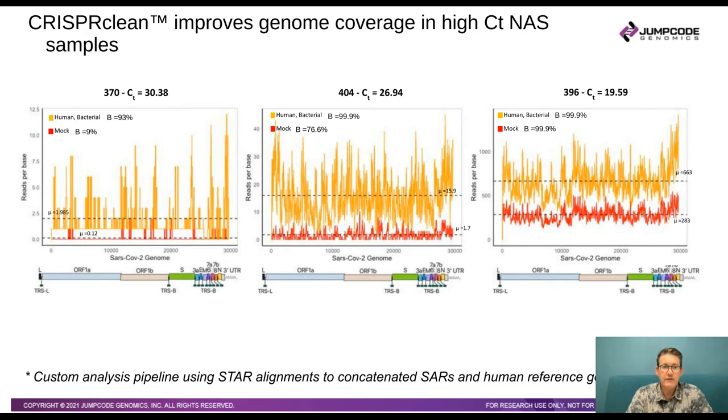And concomitantly with the genome, we can see that in the mock, we have a 9% breadth of coverage of the genome at 1x coverage or greater. And then when we deplete that sample, that breadth of coverage of the genome at 1x coverage or greater increases to 93%.